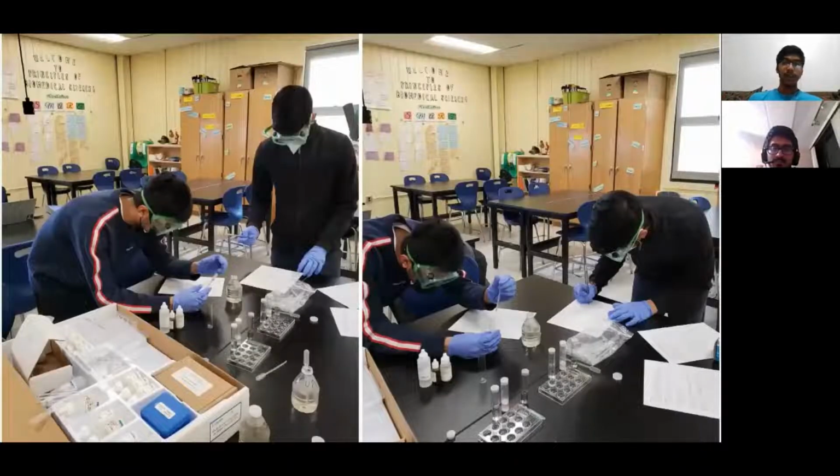So we conducted the test on each of the samples. We had collected two bottles from each of the places in the Passaic River, and then we ran tests. We tested for pH, chlorine, chromium, nitrates, phosphorus, and sulfides. In these images, you can see me and my partner conducting the tests.